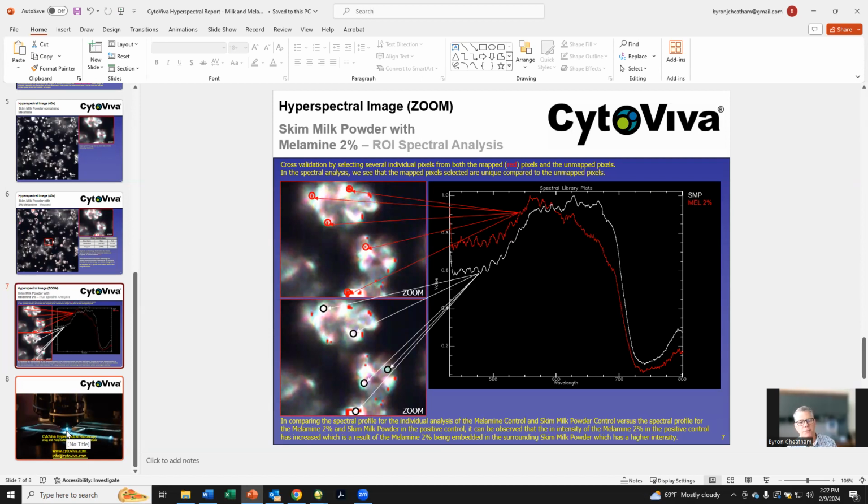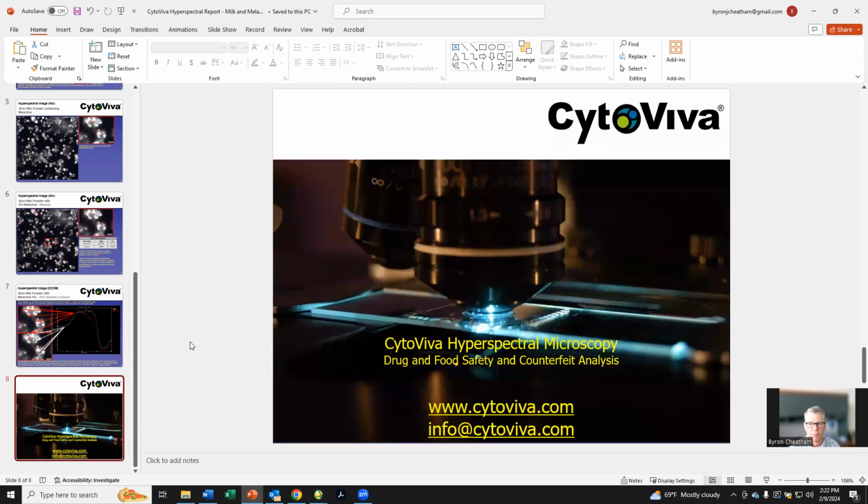So this is a very brief video just to show how hyperspectral microscopy can be utilized for drug characterization and for food characterization, looking for unsafe or counterfeit items in either of those two examples.